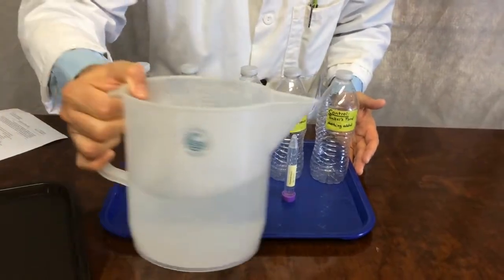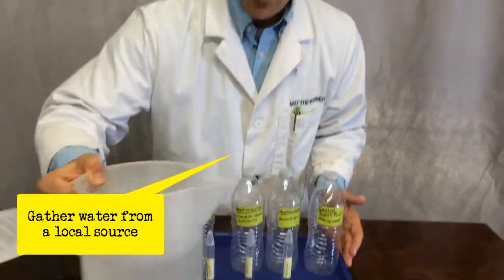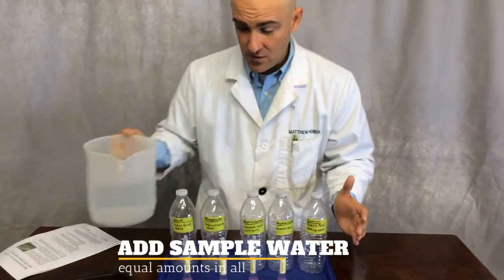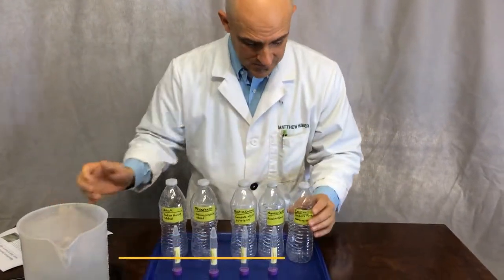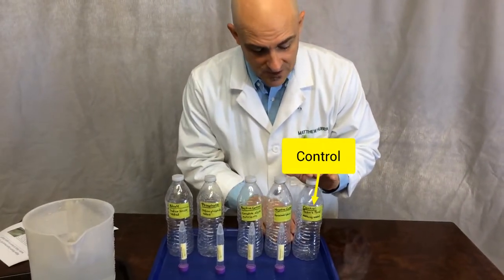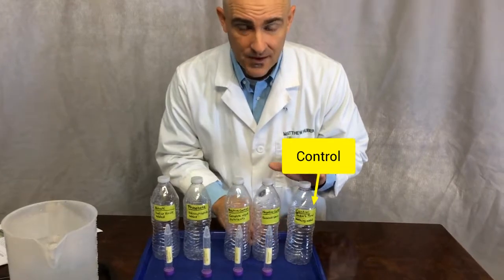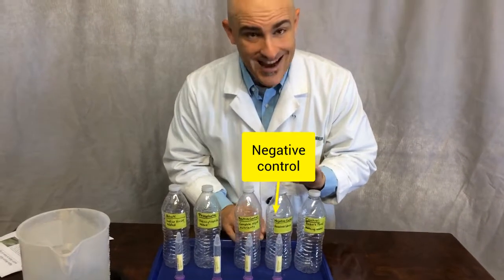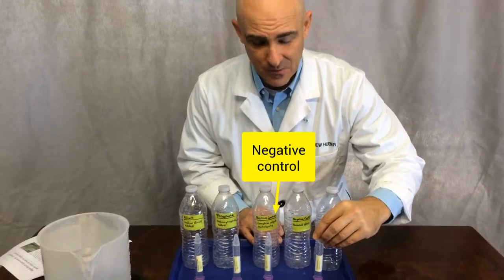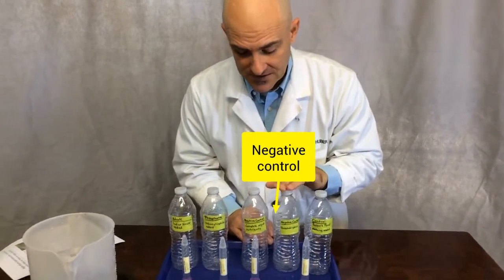You go down and you grab some water from your local watershed. You're going to come back home or to your laboratory, and you're going to add water to some empty water bottles. In this case, one of them you'll keep completely free of anything. This is your control. Next, you'll have a negative control, and this is going to have household bleach in it. You have to supply your own household bleach. It just takes a couple drops inside there.